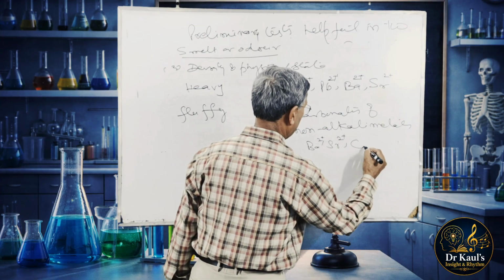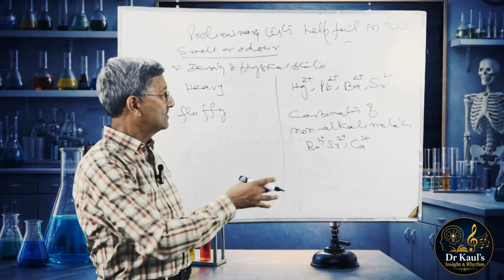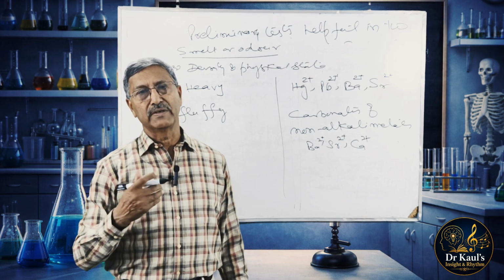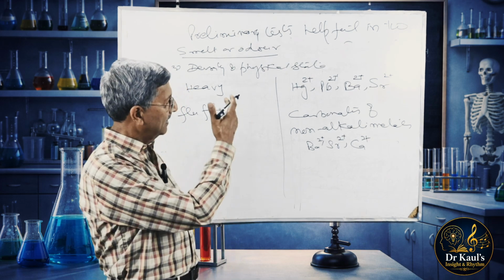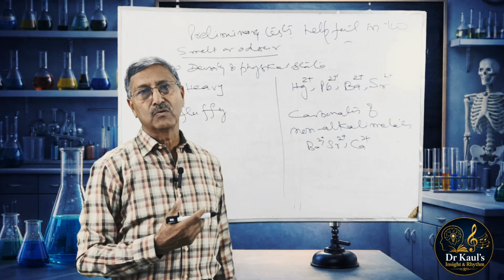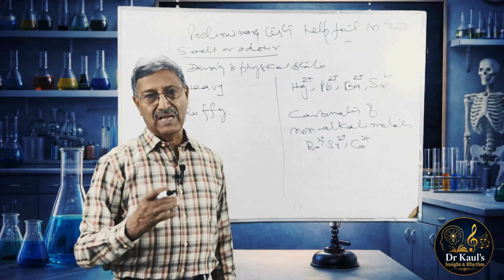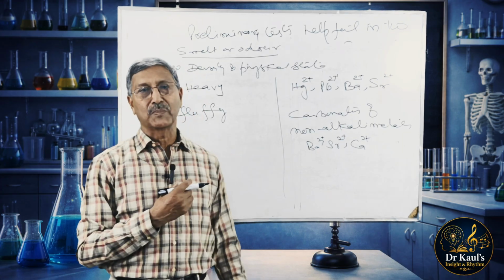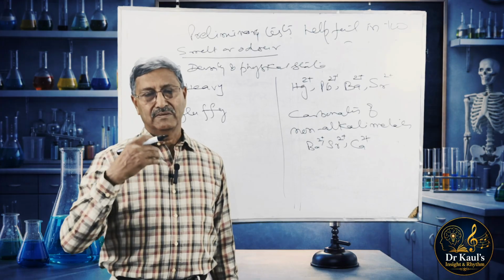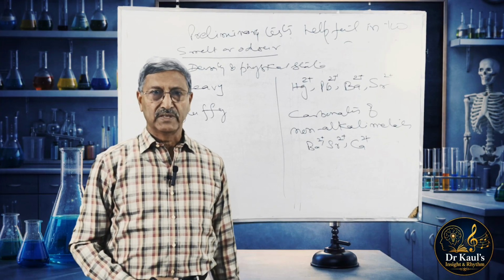So by performing these tests, we can examine the salt physically, and we can conclude from these observations that any radical could be present in the given mixture. So let's conclude the first part here, and in the second part we'll be discussing the dry heating test and subsequently the flame test also. Thank you very much.